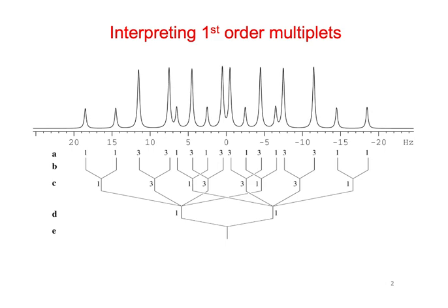And so the main thing we start to do is look toward the outside of the splitting pattern. And so we might look at the outside two peaks, and we would notice that these are in a 1-to-1 ratio.